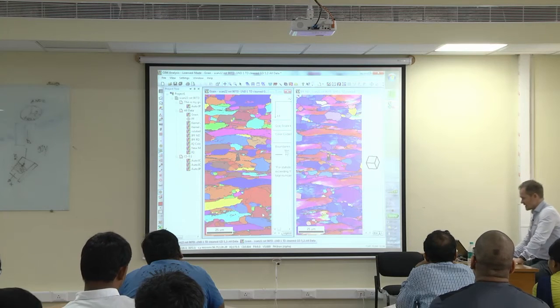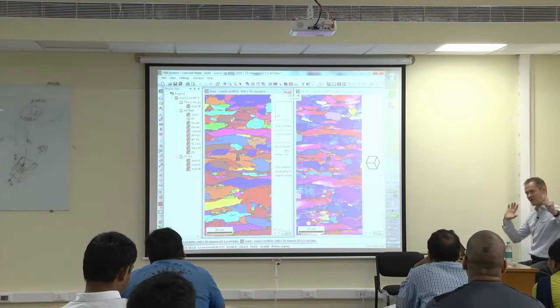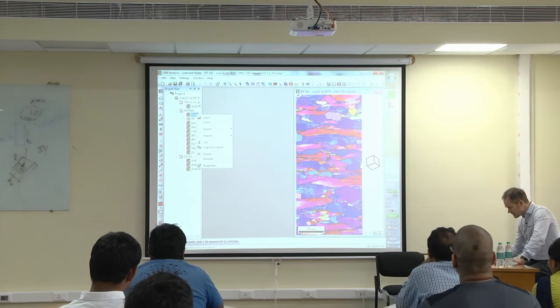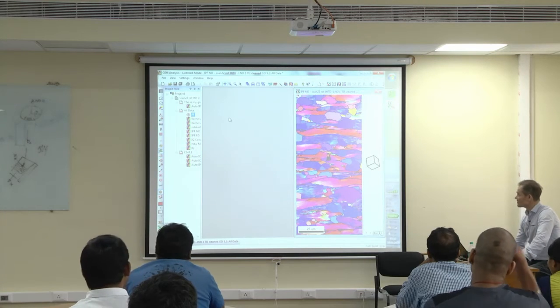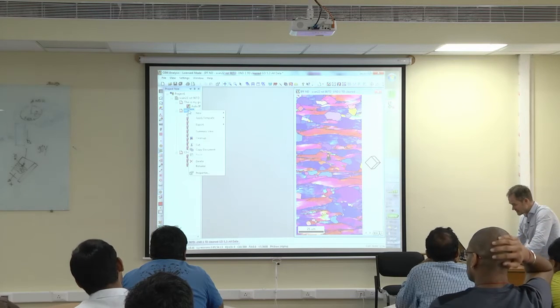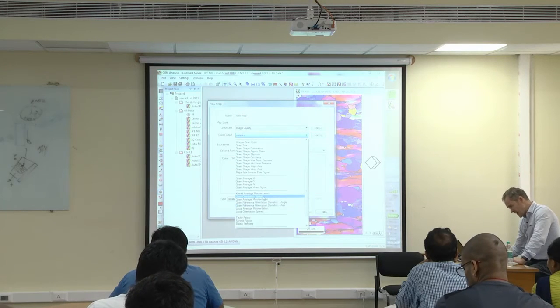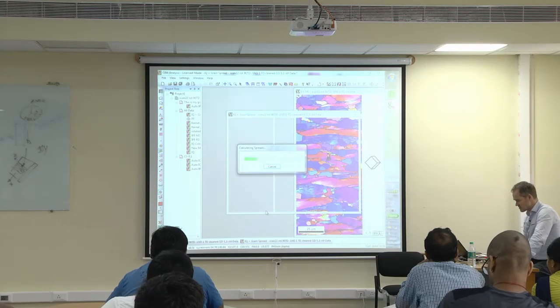Okay, now we are there. And we continue now. We say, okay, this is finished. This story, what do I call a grain or not, is finished. What do I want to do now? I want to delete that here. I want to now plot the internal misorientation. That's what I said before I came to the idea of showing you what a grain is. So I select a map, and this map will be called grain orientation spread. Let's take that and calculate.